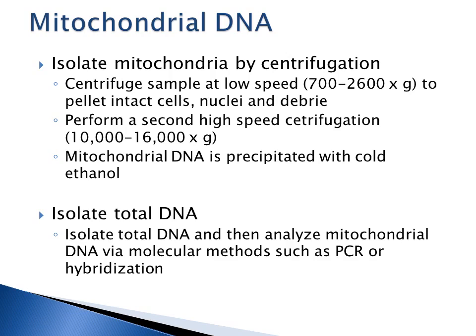So you don't even have to take the extra step to isolate pure mitochondrial DNA in most cases. However, if you are in a research lab working on mitochondrial DNA, you will isolate the mitochondrial DNA from the total DNA.